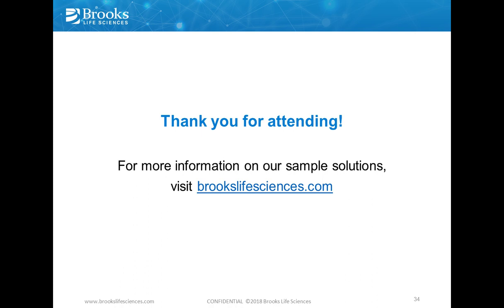Okay, our first question. Now, Markus, this may be for you: is standardization of sample collections achievable? Yes, it's achievable. I was running biobanking operations globally for quite a while. And the important thing is that you have the stakeholders in your organization on board, meaning you have to do training, you have to convince them to support this. And if your organization supports this and it is watertight, it holds through, it works. It facilitates the use of the sample collection, basically every step of the project, a lot. And in the end, you may really be able to reduce the question, can I use the sample for that purpose, to yes or no? Do I have an ICF in place or do I not have it in place?